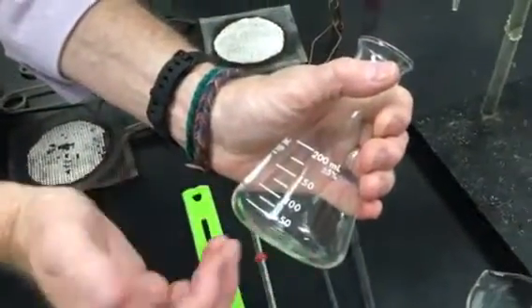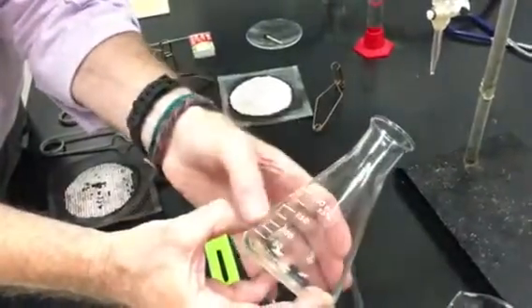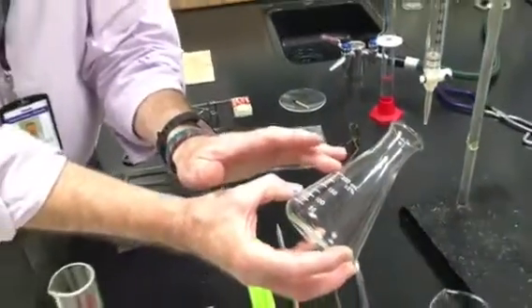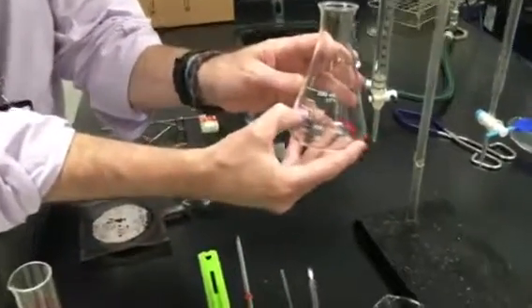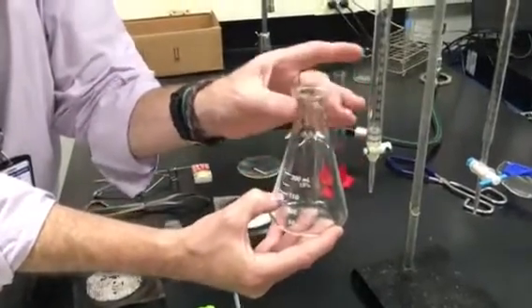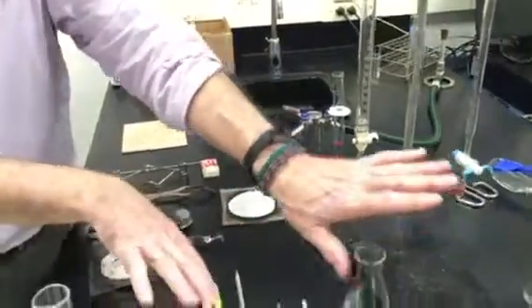So we even talk about this in chemistry. Notice how the shape of the scale changes. I would never get a volume reading from this. This is an estimate. If it's up to here, I have about 150. I would never say 150.00 milliliters. I have about 150. So least accurate, next to least accurate, and then we start to get into the sizes here.